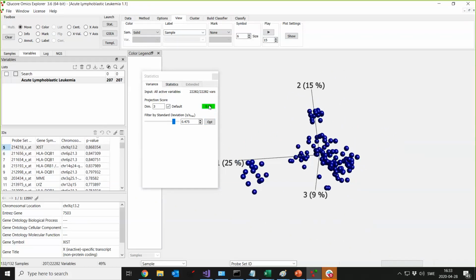But then you can immediately criticize that by saying, okay, why did you stop at that particular value? Why didn't you choose this one instead, where you could have seen that? So the projection score, since it's a peer-reviewed publication, will be useful in those situations where you want to have a scientific reference to ask you why you chose this particular level of standard deviation filtering or variance filtering.